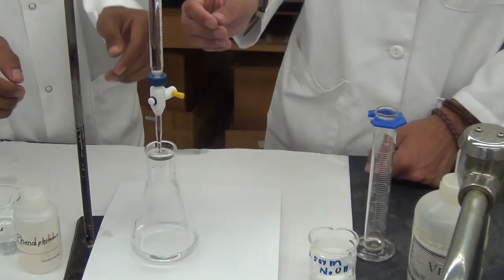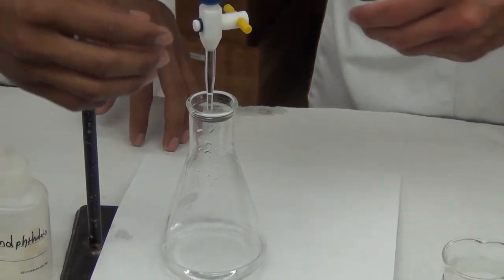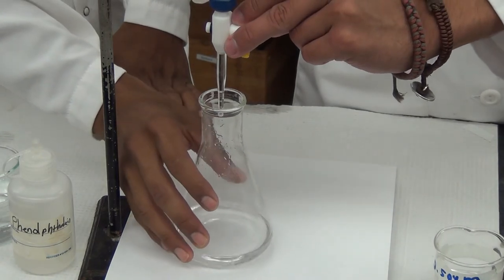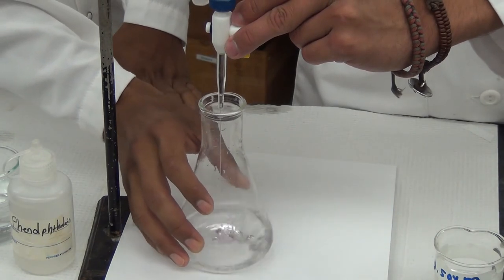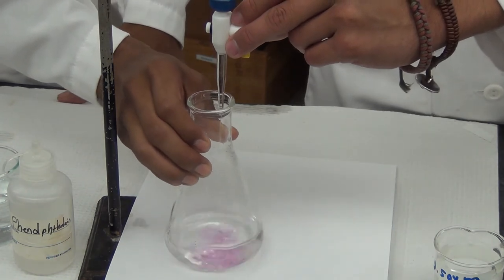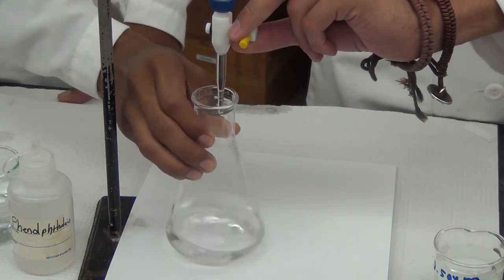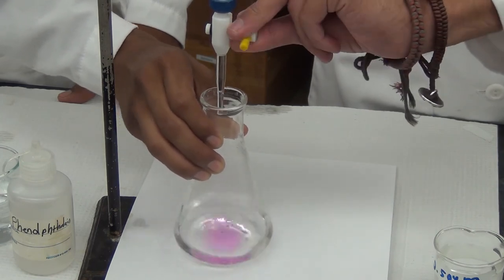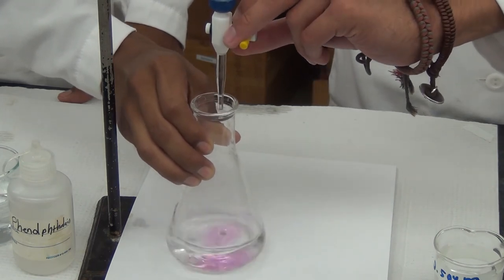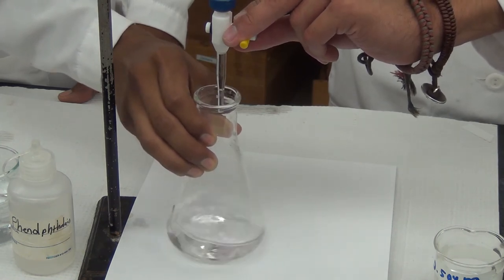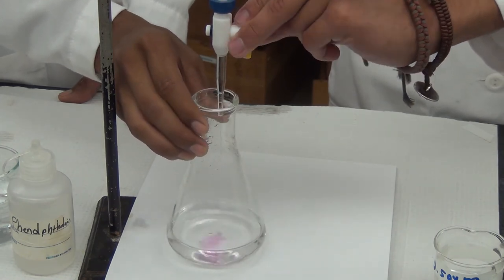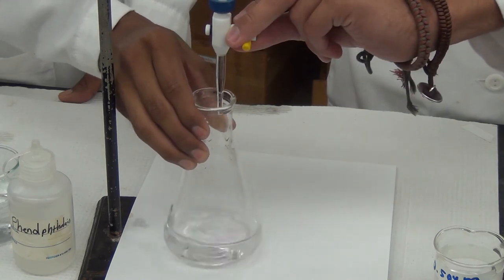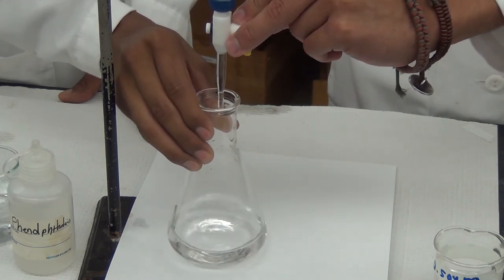To reach the endpoint, slowly add titrant to the analyte using the stopcock. As you approach the endpoint, color will begin to appear in the analyte. Slow down to one drop at a time at this point, fully mixing the drop in until the color dissipates.